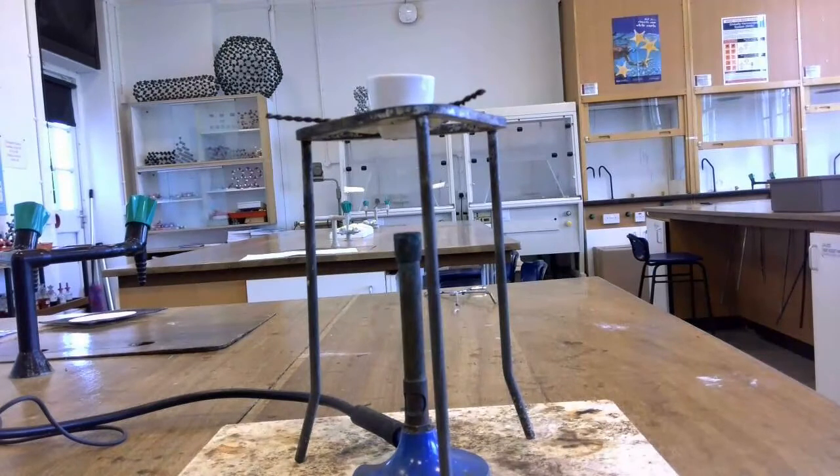Okay, so I've got my Bunsen burner set up and I'm just going to light it and heat my crucible on a blue flame. I don't want to heat it on a roaring flame because I'm not looking to decompose the crystals, I'm just looking to drive off the water. So I don't want a sooty flame which will turn the bottom of the crucible black. And I don't want a roaring flame because that would risk decomposing rather than just driving off the water.